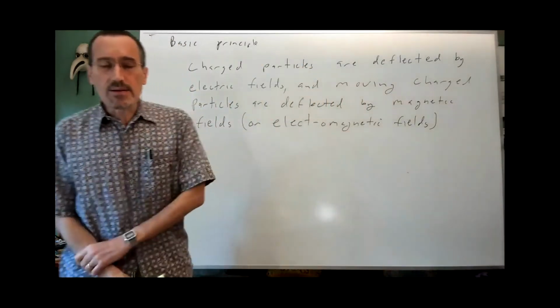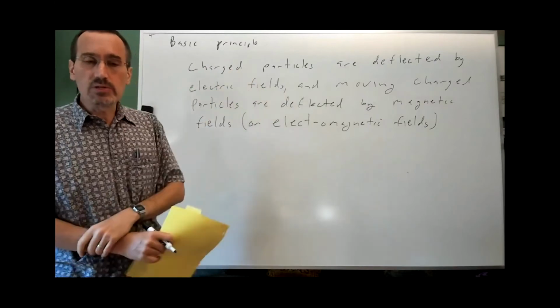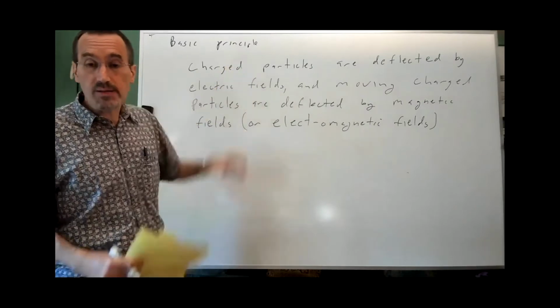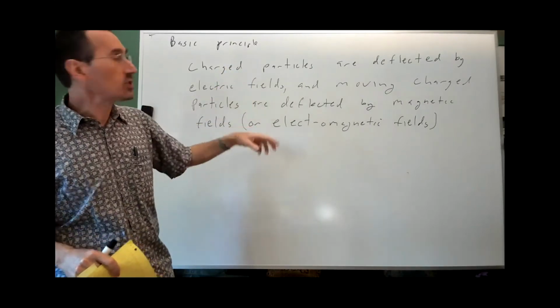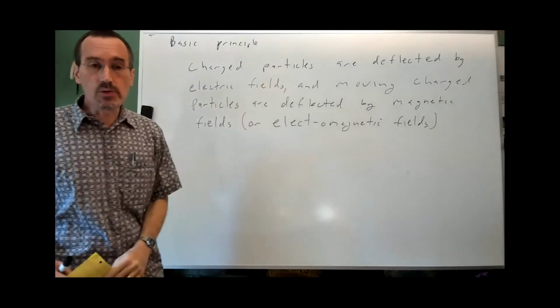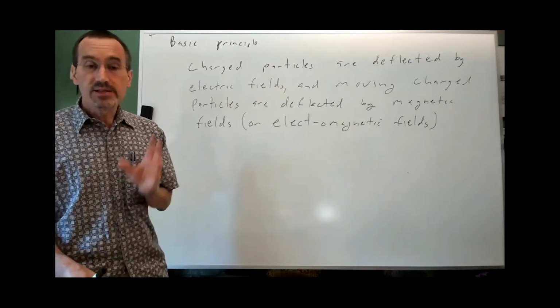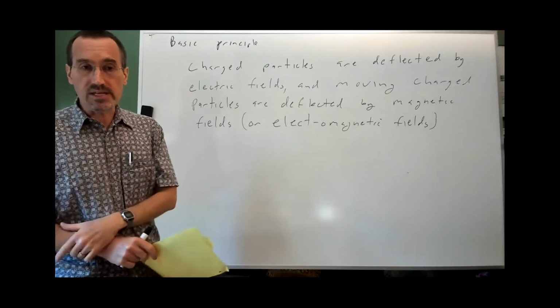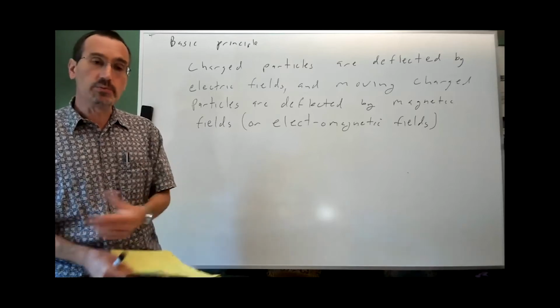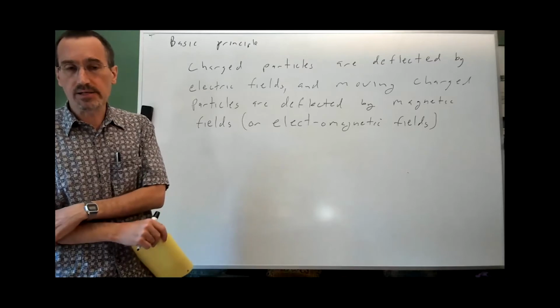The reason I'm writing this down is it's very easy to lose sight of the fact we need to get a charge. And of course, by particle, I mean molecule. So we need to get a charge onto our molecule. And since most molecules are neutral, doing so is going to alter the properties of the molecule. In short, you'll be applying a proton to the molecule or applying a sodium ion to the molecule.